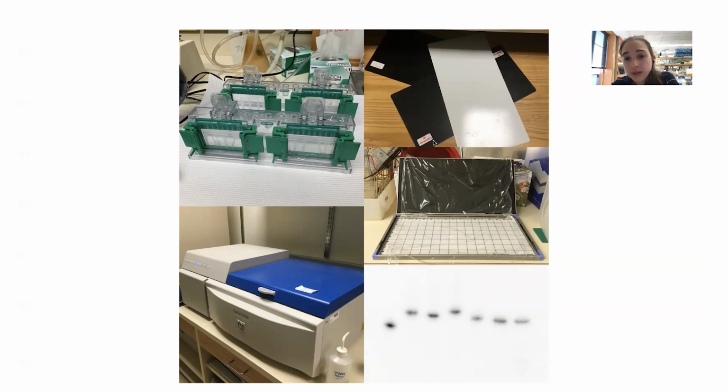If you have ethidium bromide stained your gel, you can visualize where the DNA or RNA pieces are. Although depending on how many there are, there could be a big smear. But you could do that before you do all of this radioactive stuff, when it was still in the gel and before you transferred it. Just a note, so you can then compare the location to where all of it was.